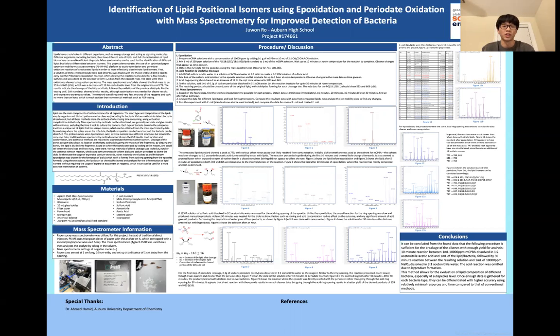Paper spray mass spectrometry can be used to quickly distinguish between the lipids of different masses, where the user would simply add the analyte onto a piece of paper and allow it to be taken in by the mass spectrometer. The mass spectrometer then analyzes the particles and determines their mass. A problem with this method, however, is that it cannot distinguish between isomers, notably the position of the double bonds. This especially becomes a problem at the subspecies level, where the m/z data becomes difficult to distinguish.